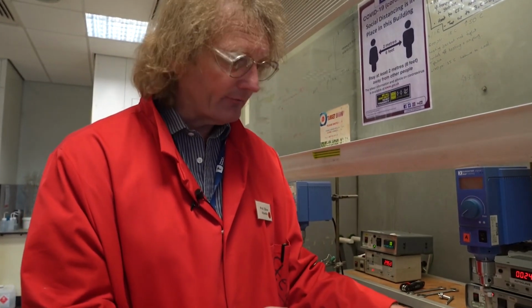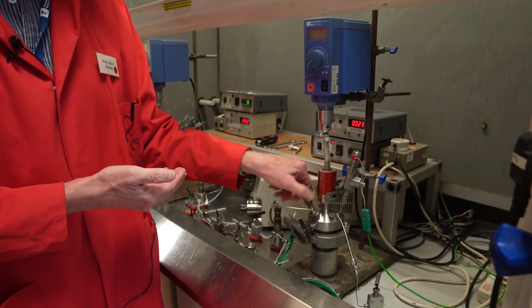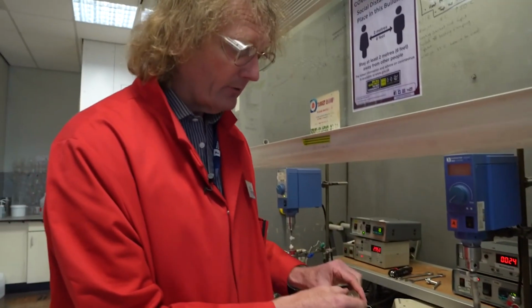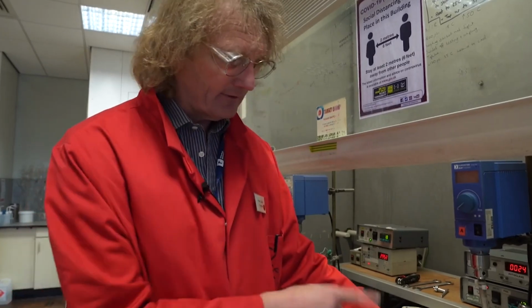Because if I want to open up this vessel, you can see I've got to take off this key, and the pressure inside will be relieved if there is any pressure inside. It's going to come out because there's going to be a hole there. So only at that point, when we know there's absolutely no pressure left behind, will I then be able to use this key to undo the clamp. That's a really important aspect of how we work safely in this department.